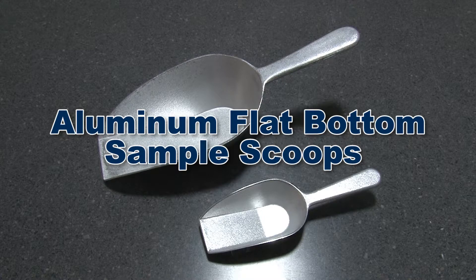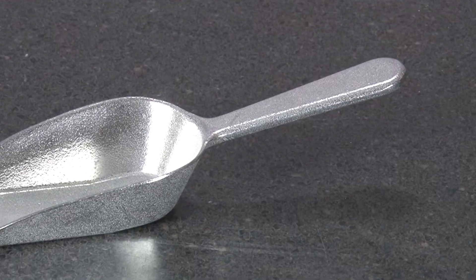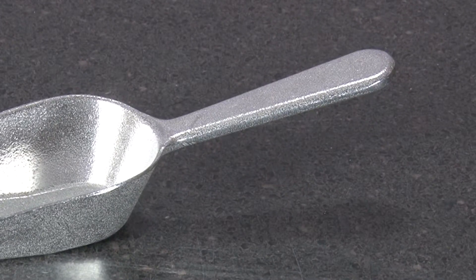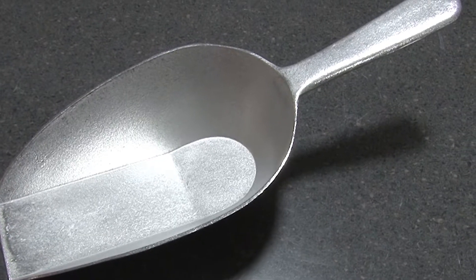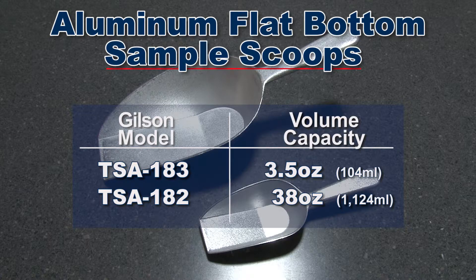Aluminum flat bottom sample scoops are also constructed of die cast aluminum and have a firm sure-grip handle. Flat bottom scoops are especially useful for gathering sample material from the bottom of a pan, and Gilson offers aluminum flat bottom sample scoops in 2 different volume capacities.